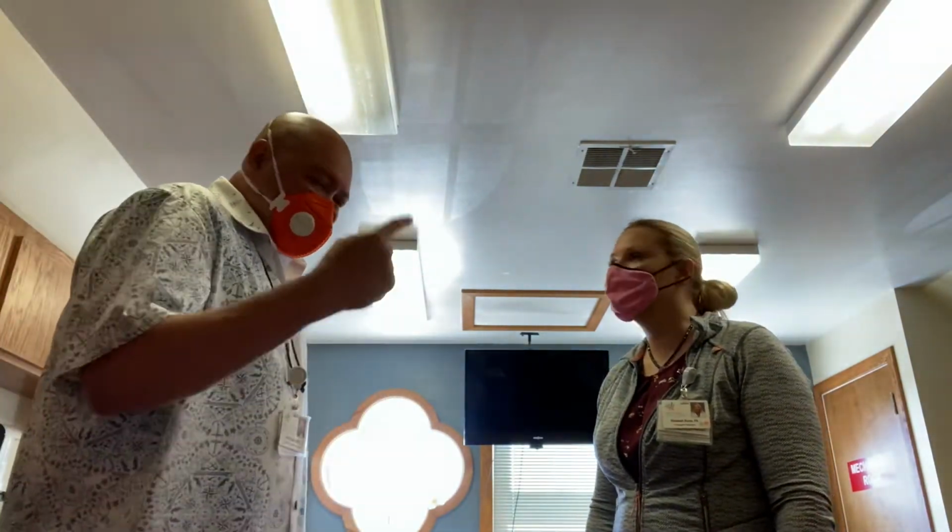Okay. She's done her hand sanitation. Make sure, number one, that's the major thing that we need to do, is make sure that there is proper hand sanitation.